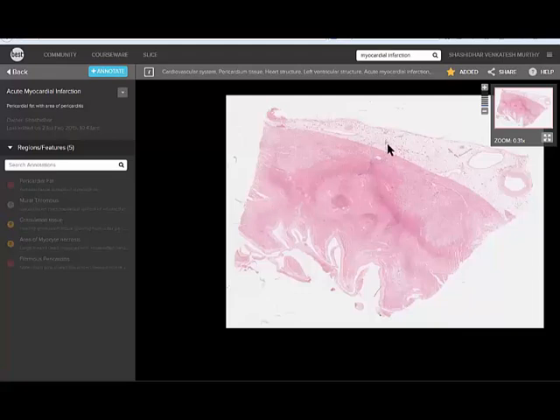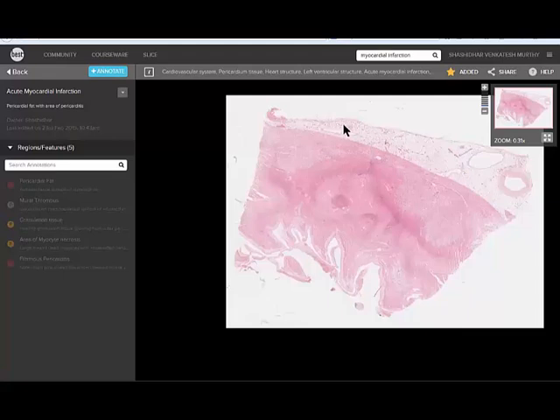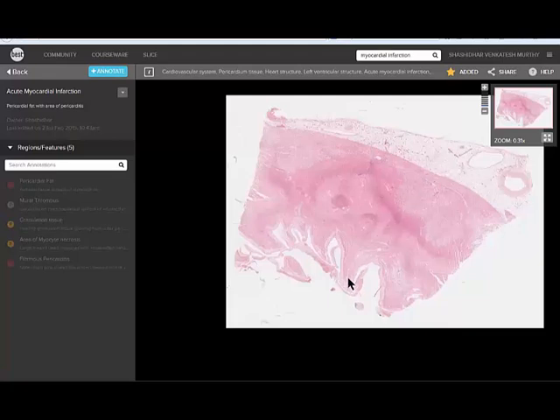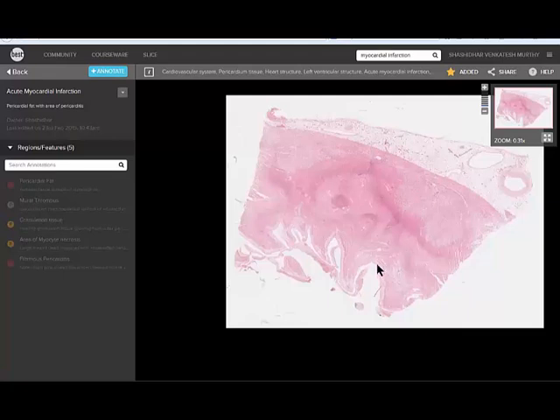If you remember, the blood supply, coronary vascular supply is from outside to inside. The blood vessels are in the pericardial fat. That's the cut section of the coronary artery. The blood goes through branches, penetrates, and then starts supplying from here. This is the most distant area from the blood vessel. Any obstruction of the blood vessel, first area to die is here, the endocardial surface.